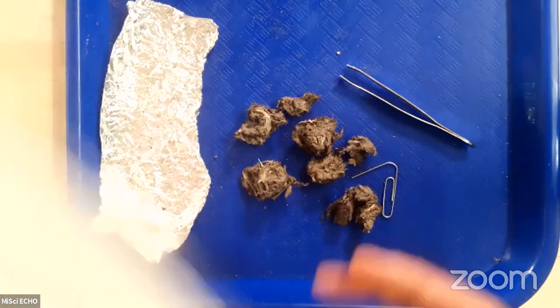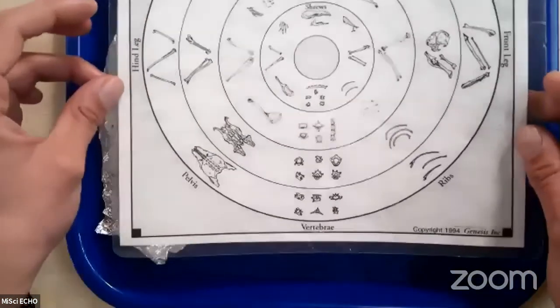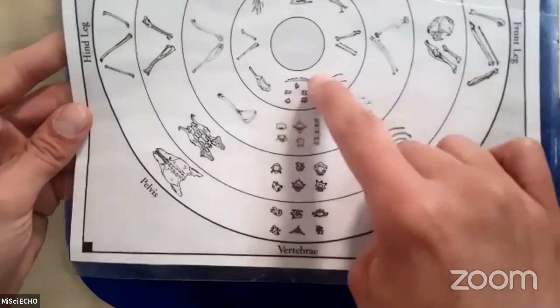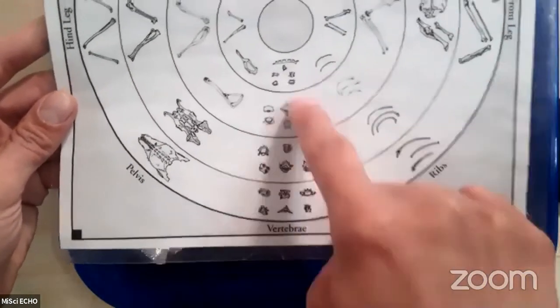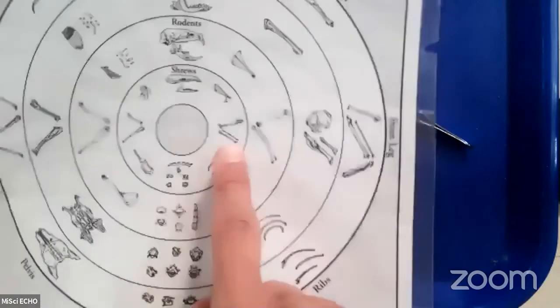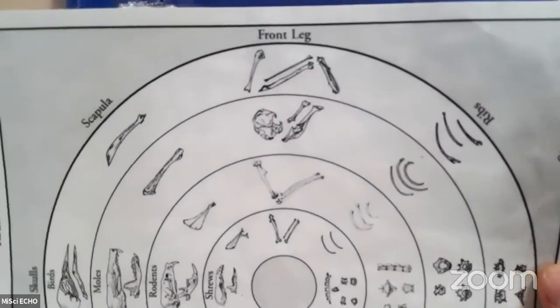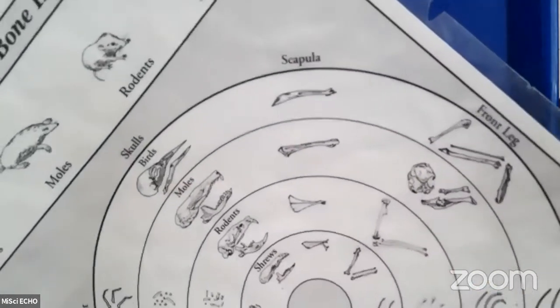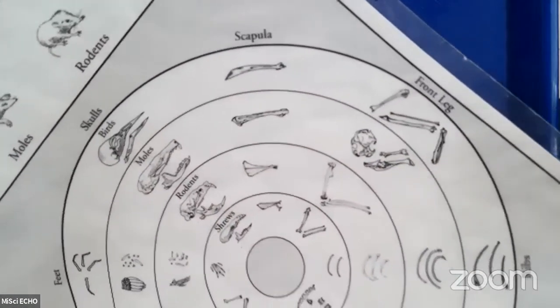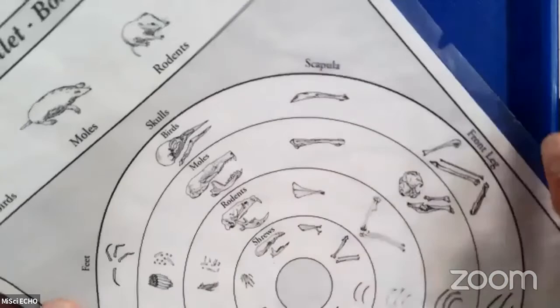We'll be referring to this dissection guide, which is very, very useful because it's sorted all of our different bones and pieces of these organisms by type. So we might find things like vertebrae, which are pieces of the spine of these animals. We're going to find lots of ribs. We'll find things like front legs, which you can see, depending on the organism, look very, very different from each other. We also have scapula, which are the shoulder bones. So if you reach back and give yourself a pat on the back, what you're tapping is your scapula in a human. And so we might find some of those.